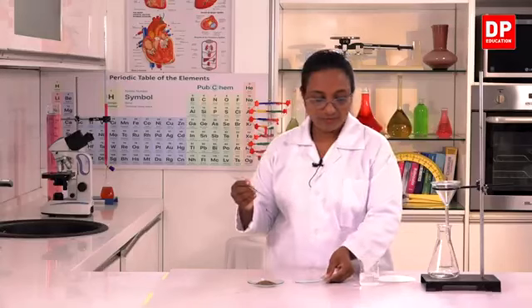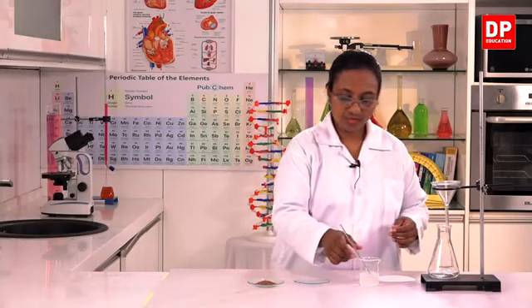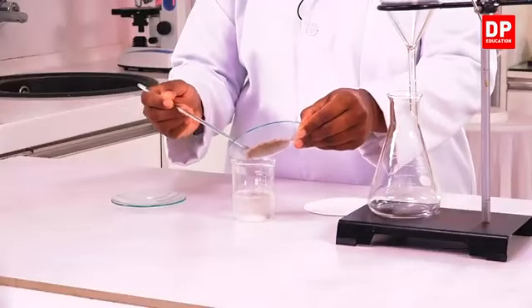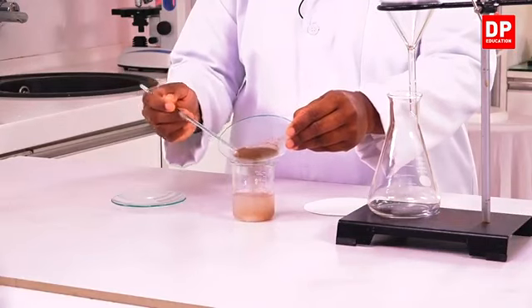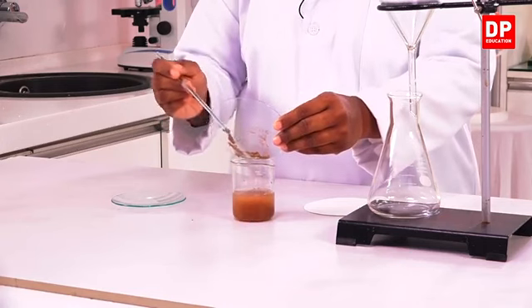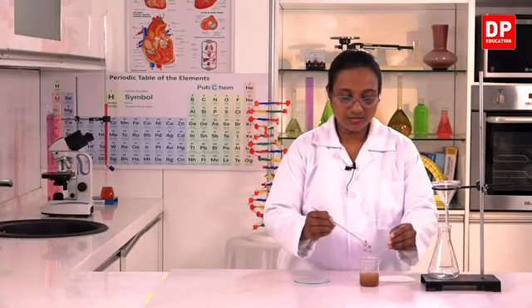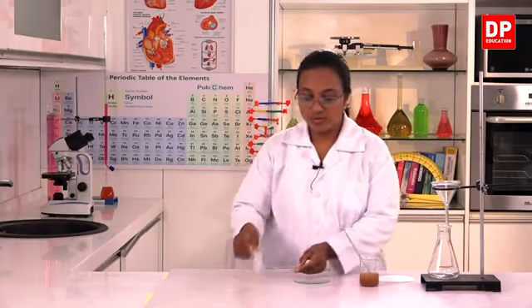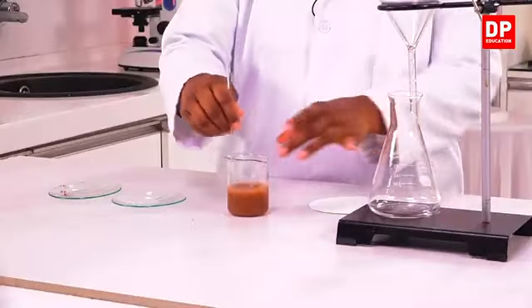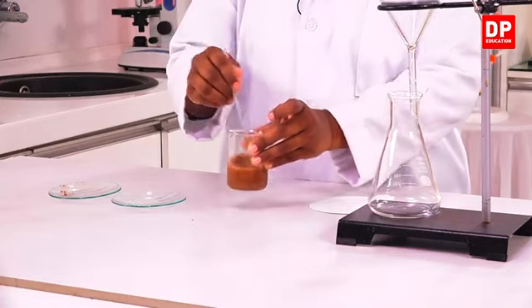So I have 5 grams of salt dissolved in water, and also I will add about 10 grams of soil. So now you saw that it is a mixture that has water as the solvent and salt, that is sodium chloride, and soil as the two solute components.